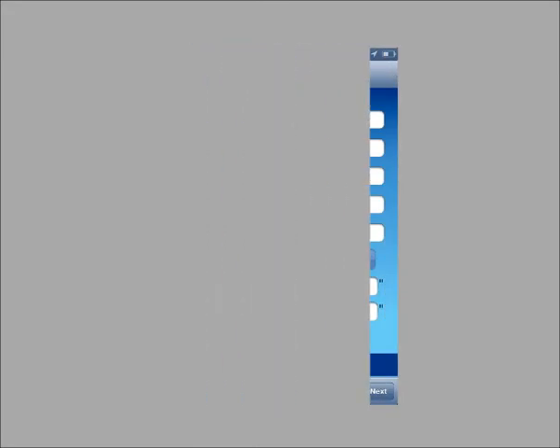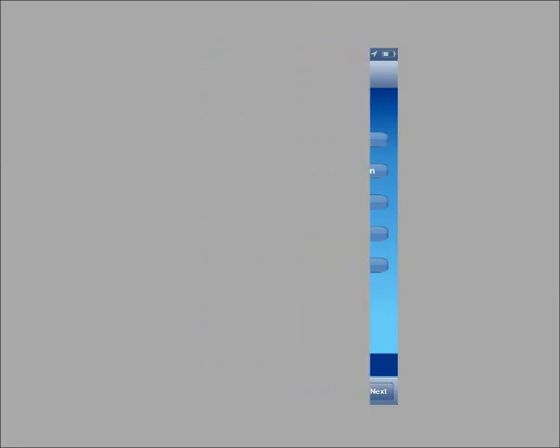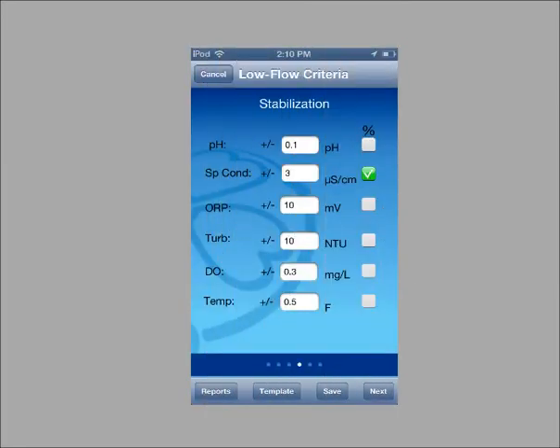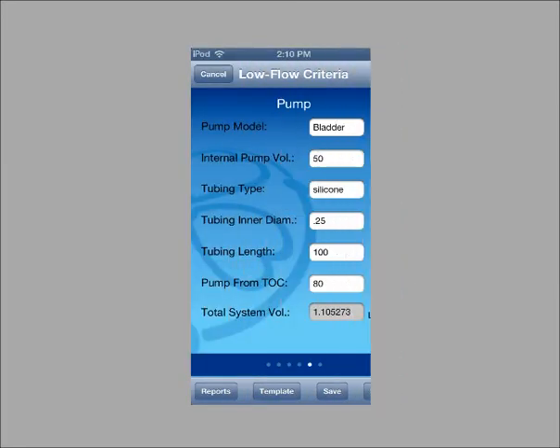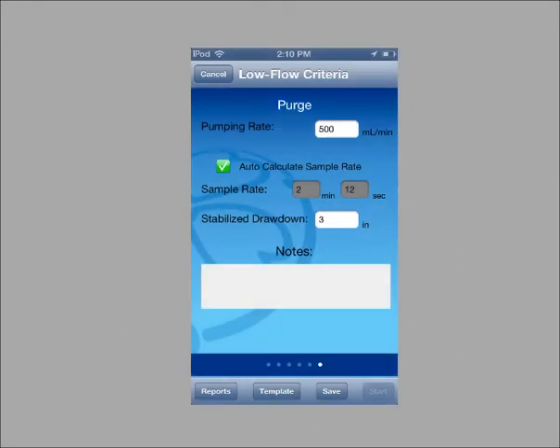You can swipe through to look at the screens if you want. When you are ready, turn the battery pack on. The start button in the app becomes active. Tap the start button when you are ready to begin the low flow test.